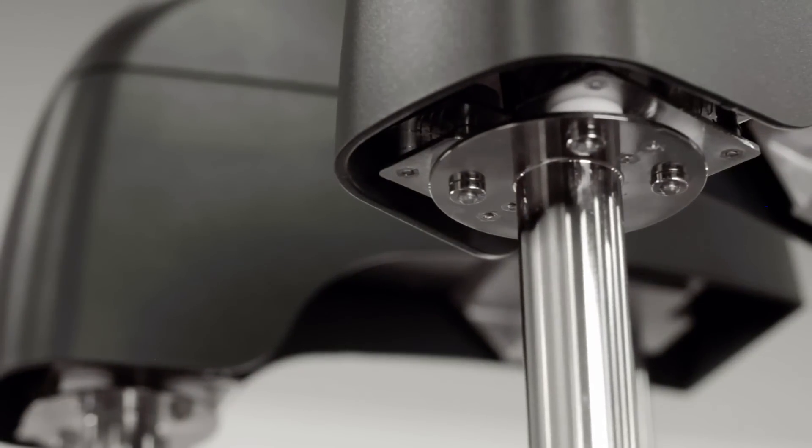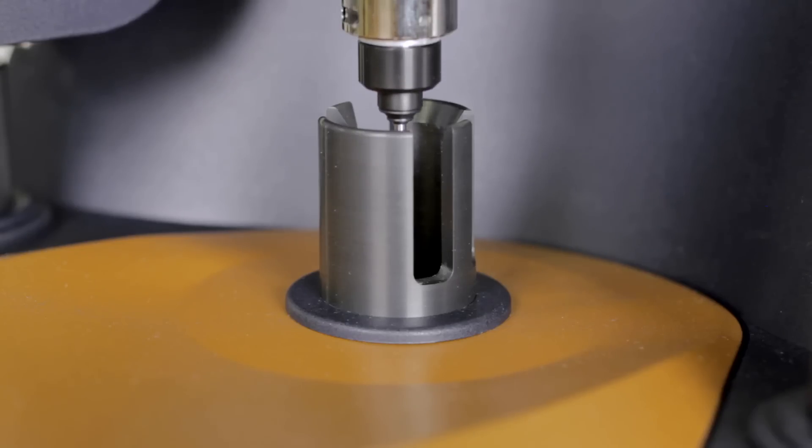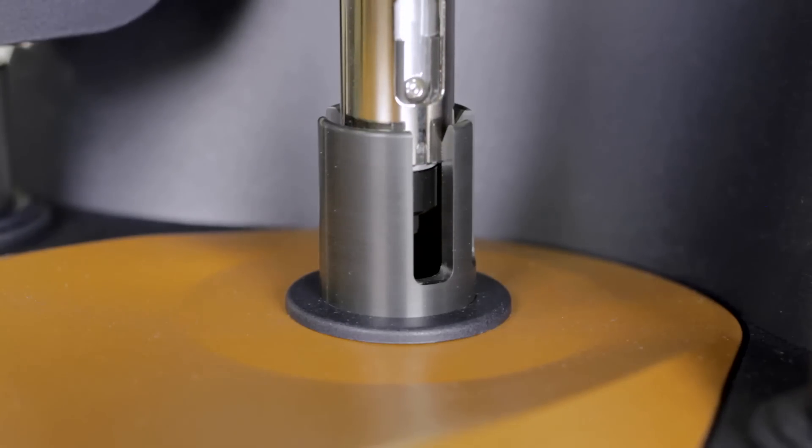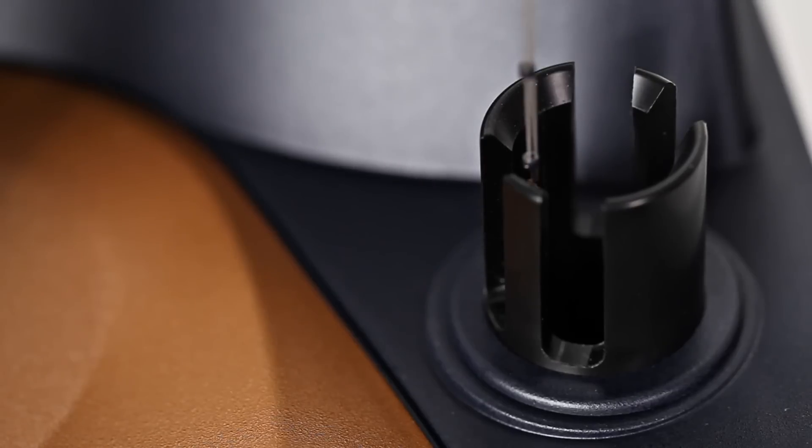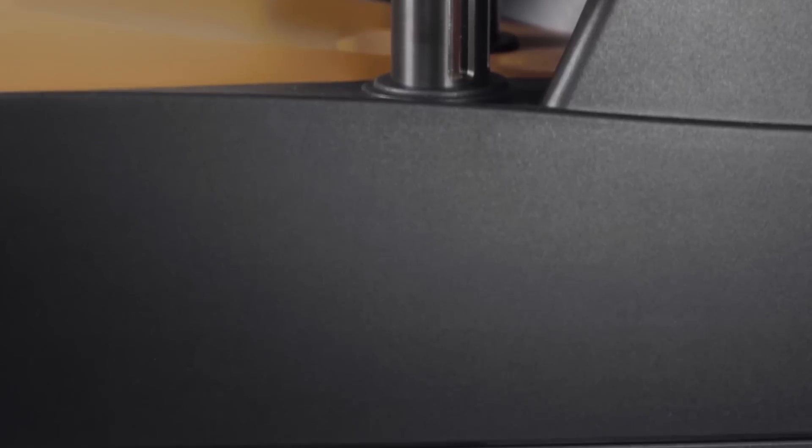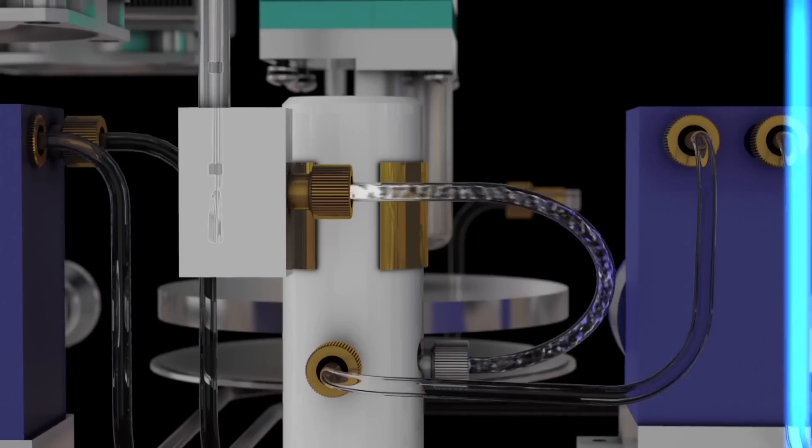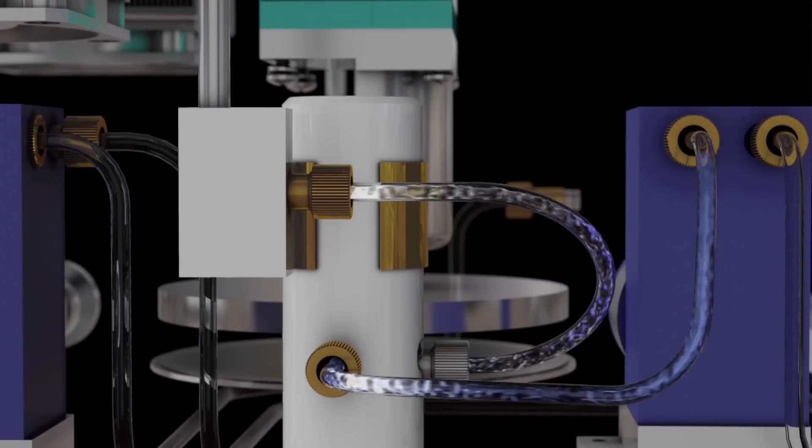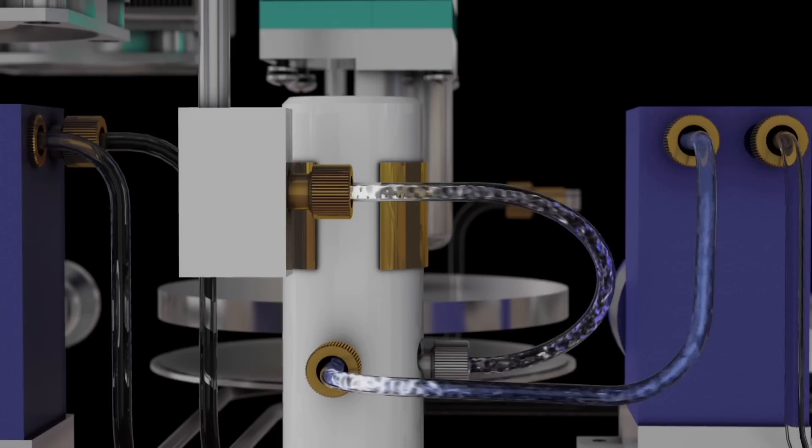Intelligent hardware positioning eliminates these issues and ensures accurate and reliable placement of automated hardware on the Affinity ITC. The automated cleaning system engineered into the Affinity ITC auto ensures that the entire system is cleaned between sample titrations, completely eliminating cross-contamination from one run to the other.